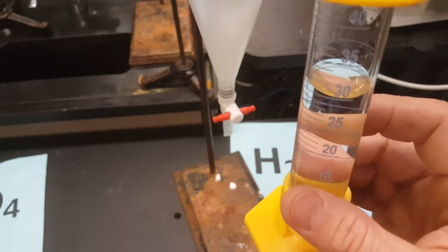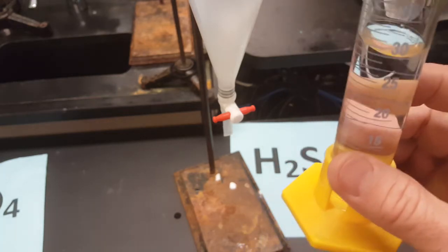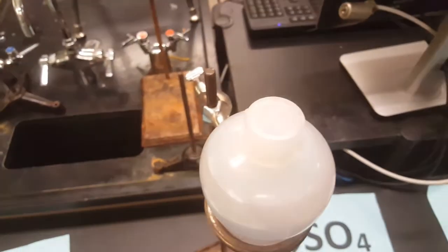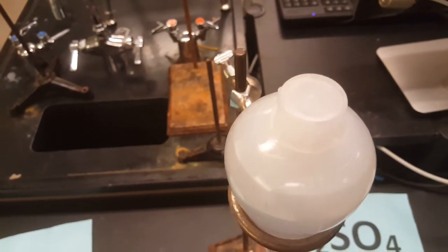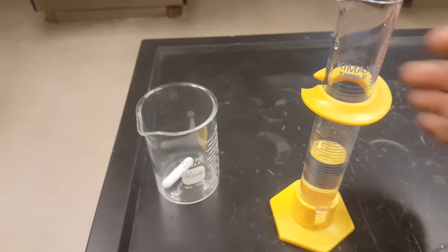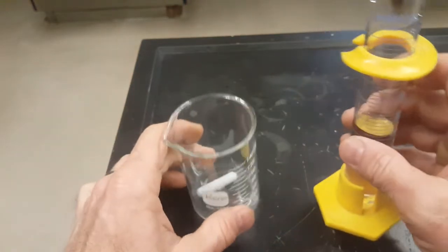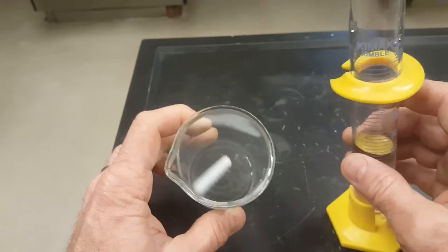If you end up going over like I just did, then just open up the top and pour it back in. Here's my 25.0 milliliters of sulfuric acid. And here's my empty clean beaker.